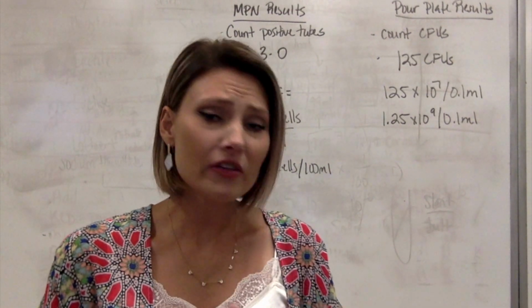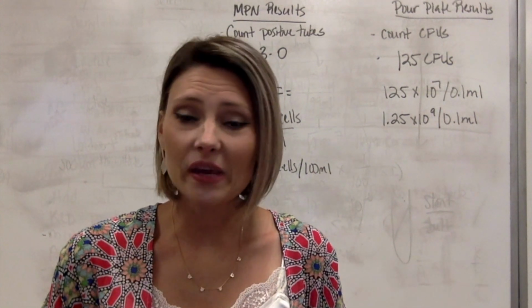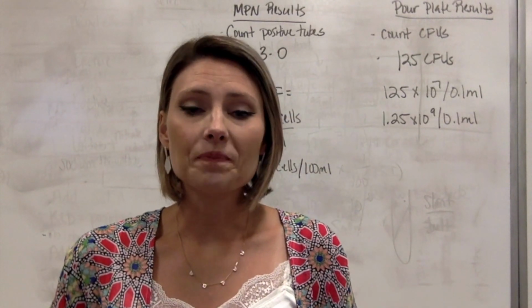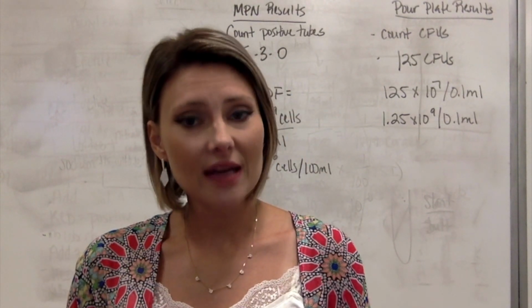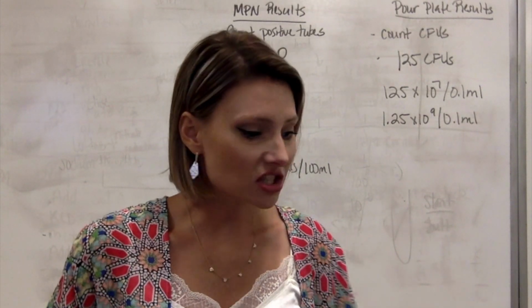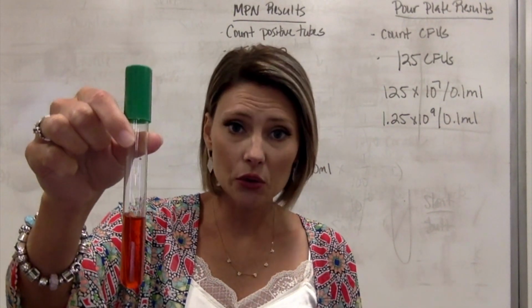So the MPN technique uses lactose broth. We are going to be counting E. coli cells, and if you can remember from our carbohydrate test, that E. coli ferments lactose. So we're going to actually be using the same exact kind of tubes that we used in the carb test. So phenol lactose.